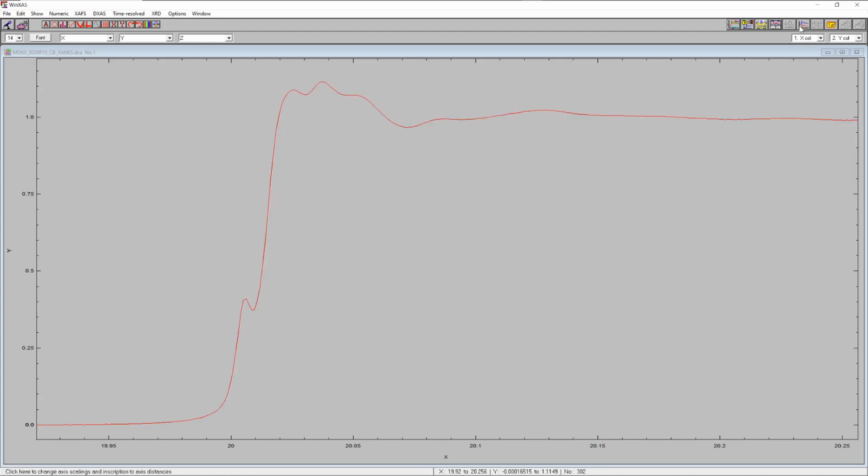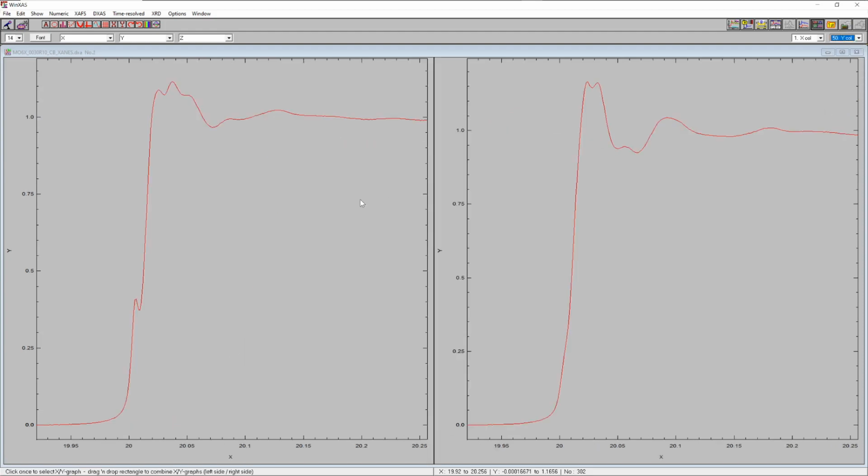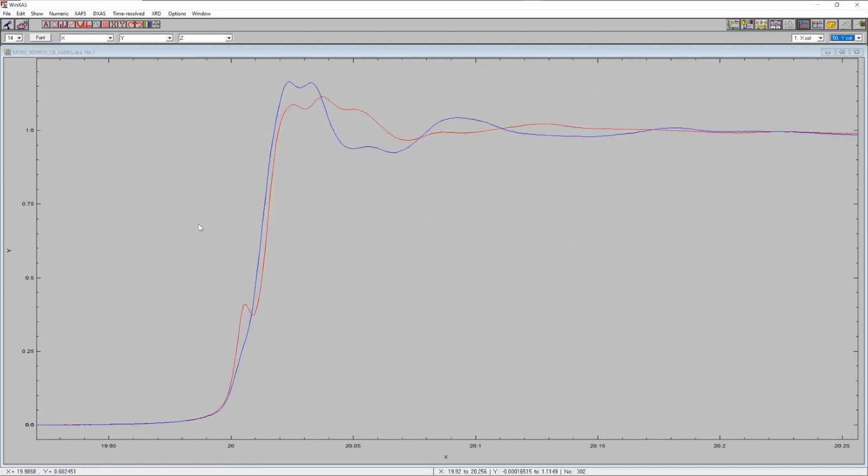So now we want to make sure that we select a range that includes the maximum in the first and in the last spectrum, of course. So we just go all the way to the last spectrum, and then we can just superimpose the two, so we have molybdenum trioxide and basically what is mostly molybdenum dioxide, and those are the two features now. Those are the maxima that we want to determine in molybdenum trioxide and molybdenum dioxide spectra.